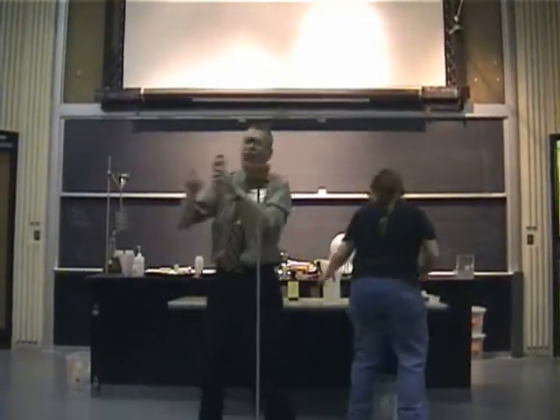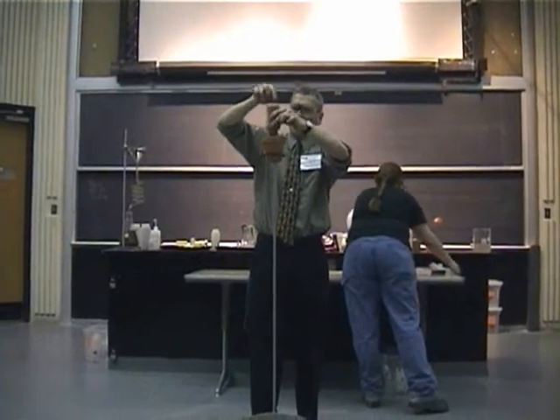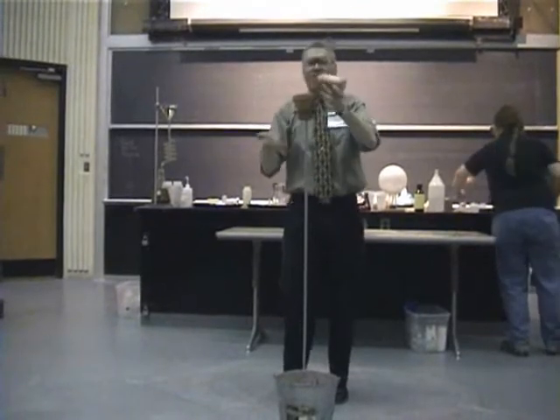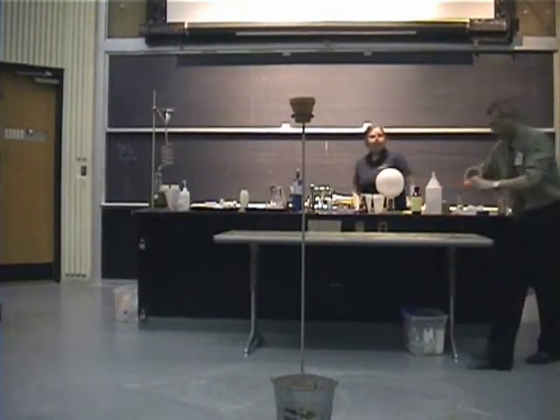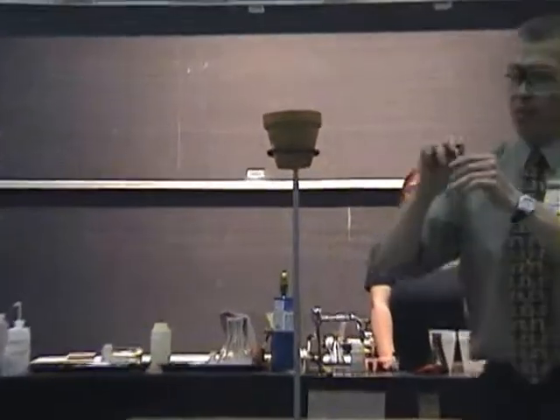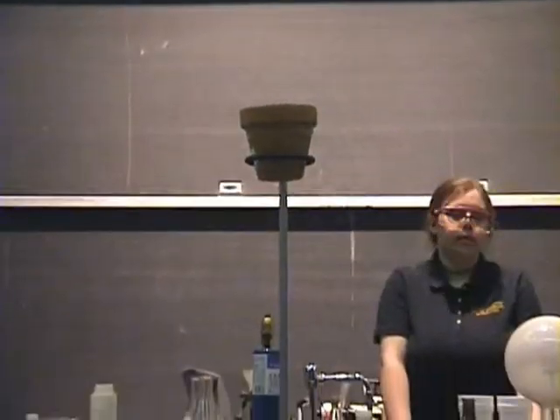If I take this thermite mixture, which is a powder, and pour it into a flower pot — this flower pot has a hole in the bottom that I have blocked with a piece of paper. When I ignite this mixture, I'm going to ignite it with a fuse so I don't have to be in the neighborhood.